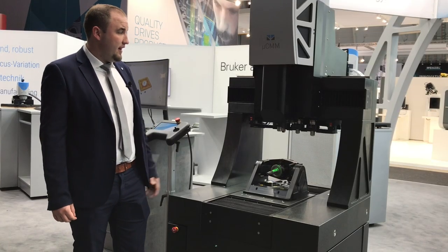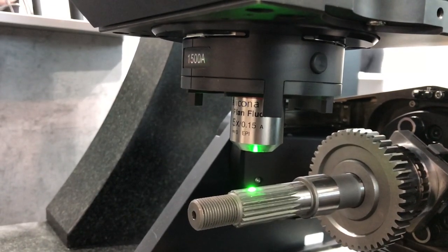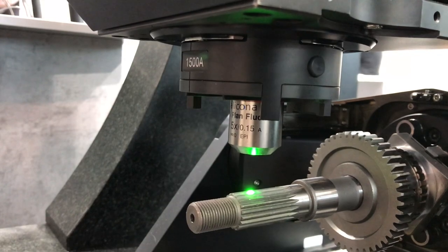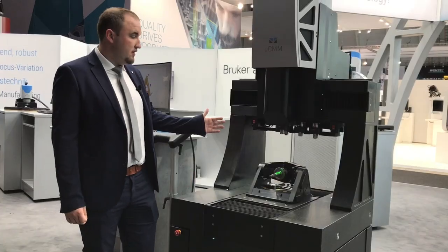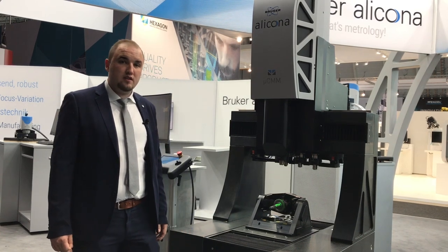The optical unit has been completely redesigned and the focus variation technology has been extended to include SmartFlash 2.0 technology. SmartFlash offers us the possibility to measure both highly polished and matte surfaces.